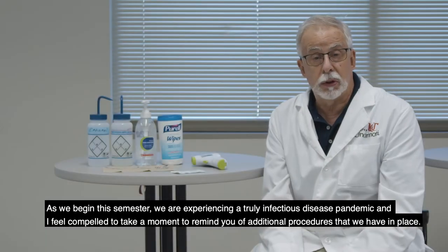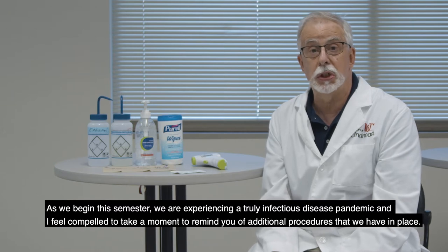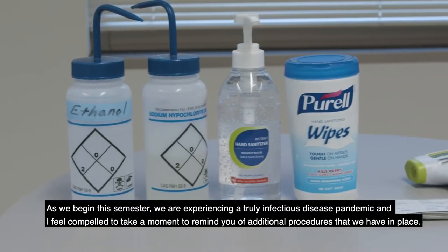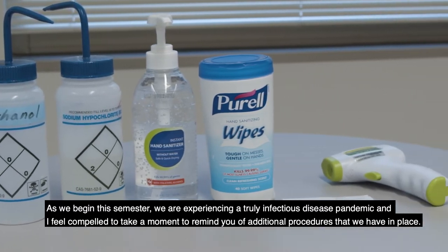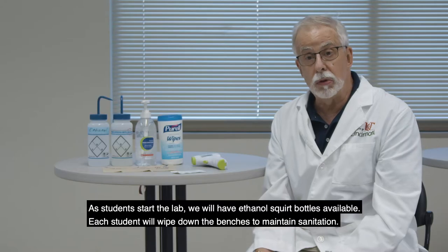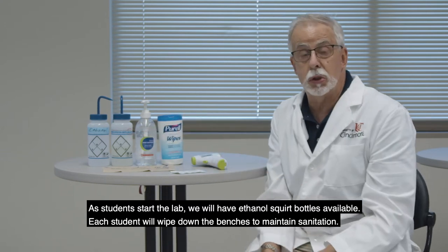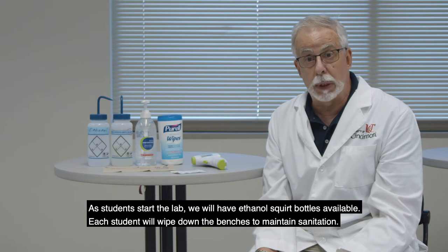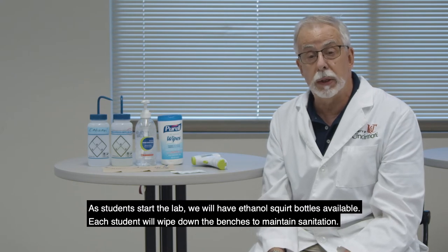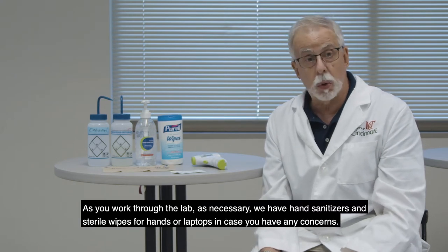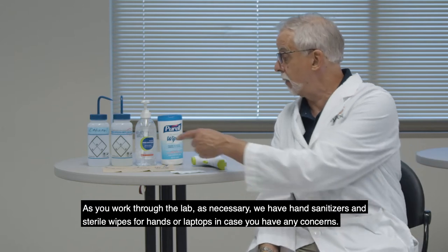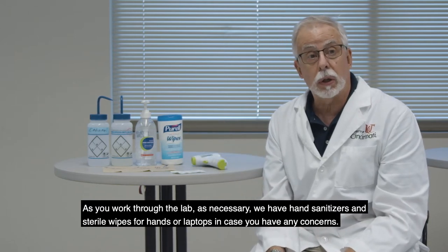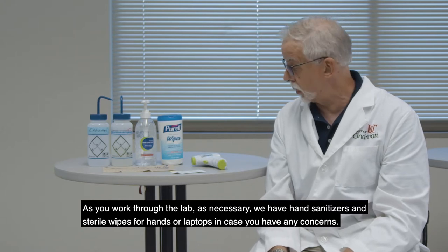As we begin this semester, we are experiencing a truly infectious disease pandemic, and I feel compelled to take a moment and remind you of additional features that we have in place. As students start the lab, we will have ethanol and bleach squirt bottles available where each student will wipe down the benches to maintain sanitation. As you work through the lab, you necessarily have hand sanitizers and sterile wipes for hands or laptops in case you have any concerns.